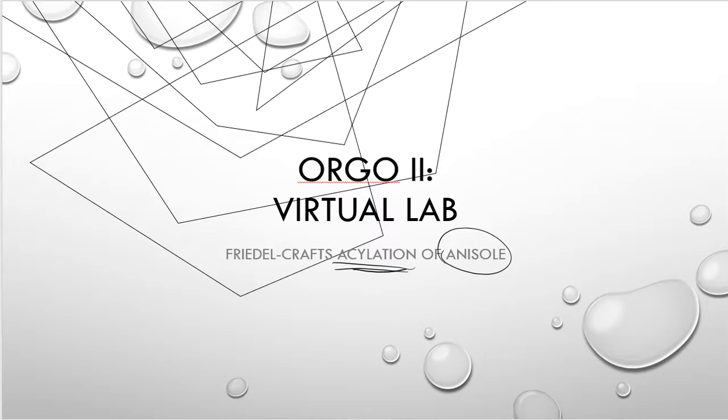So basically, if you go back probably 4 weeks from today and look at the material that was introduced, benzene reactions, substituted benzene reactions, the ortho, para, and meta directors. If you look at the acylation, which involved the carbonyl family, now we're talking about carbonyl families and carbonyl reactions. And then, at the very end of this laboratory experiment, we're going to be using FTIR to determine the product that we have made. So this laboratory does an excellent job, which is why I love it, of wrapping all of this lecture material up into one nice little package for you, so that I can give it to you with a bow and you can slowly open it up and explore the wonders of this organic chemistry lab.